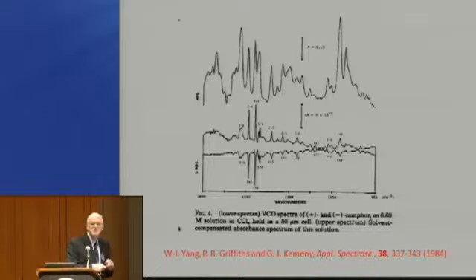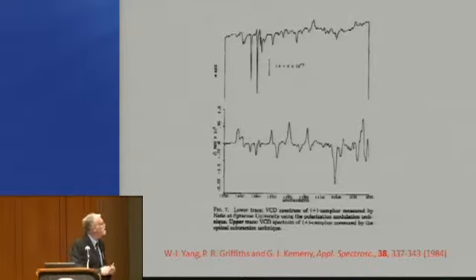I mean, this is what you should see. You should see the spectra going in opposite directions. And then we actually compared them with what Larry had measured with his technique. This is one of ours, and this is the spectrum of Larry's, and they are obviously very different. There are some similarities. This was actually measured at higher resolution, so these two bands are sharper. But you can see some bands which are there, but the artifacts are as big as what you want to see.